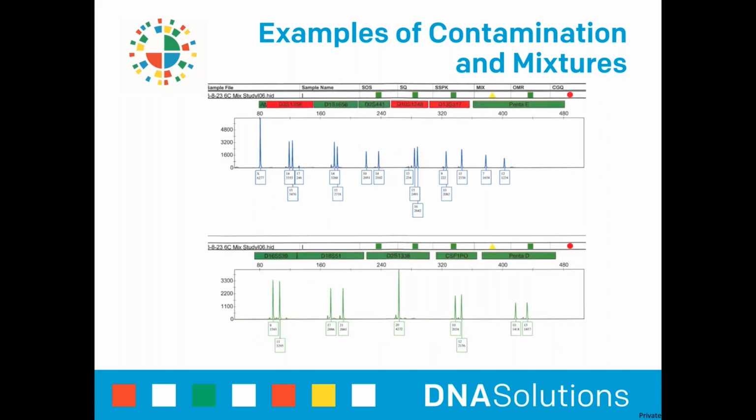Here is another example of a mixed profile. However, this particular one only has a few markers showing the presence of a second individual. Because this is a low-level mixture with a discernible major contributor, this profile could undergo a mixture analysis.